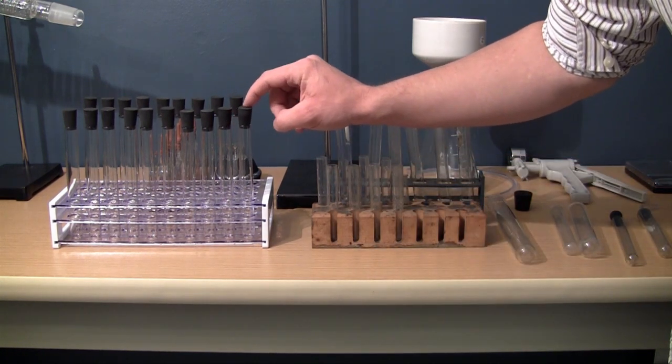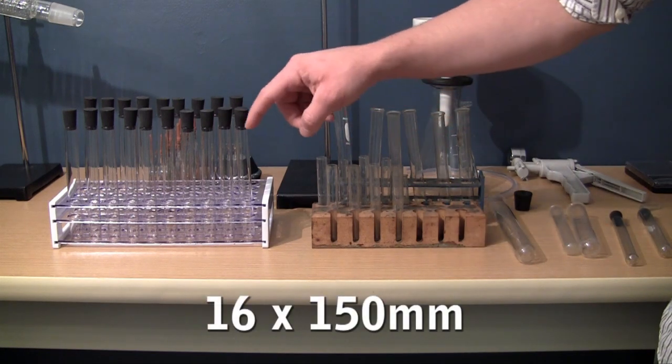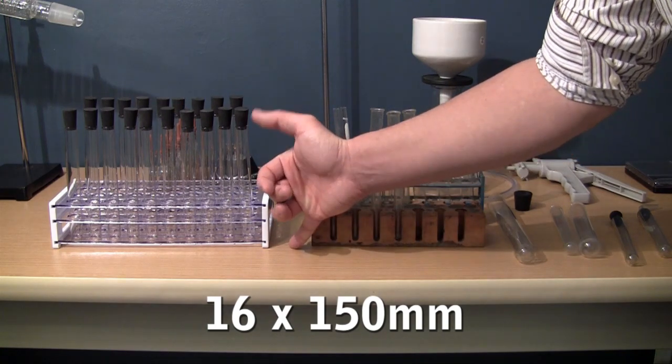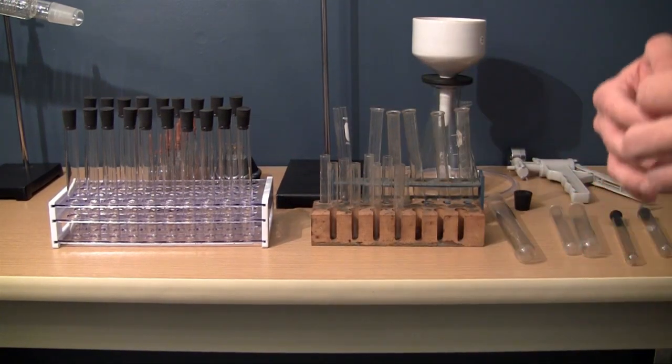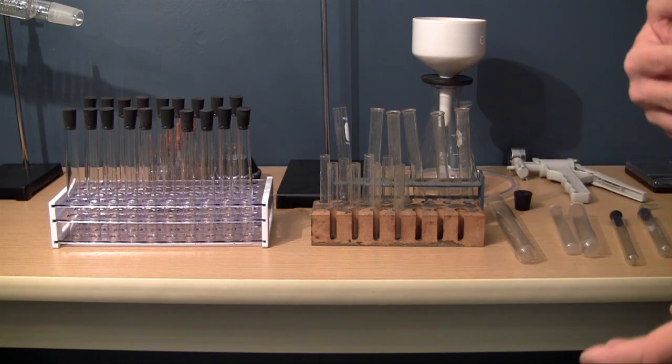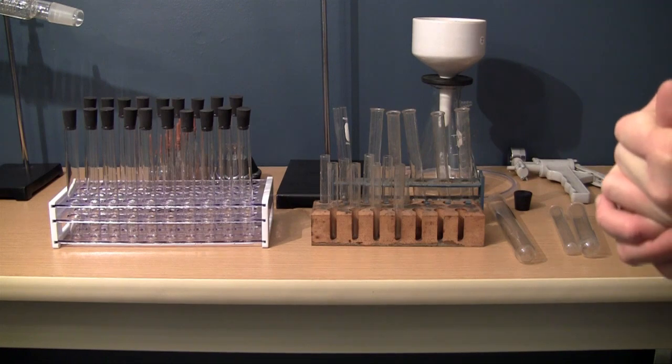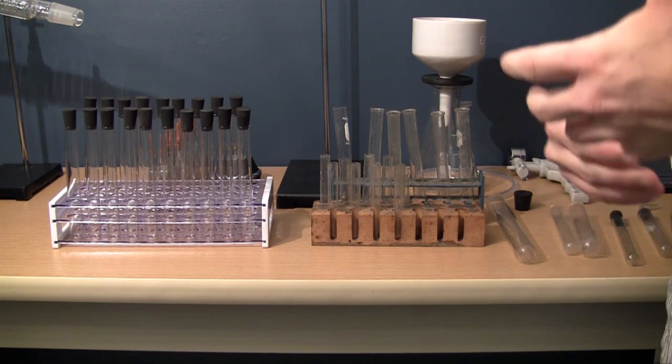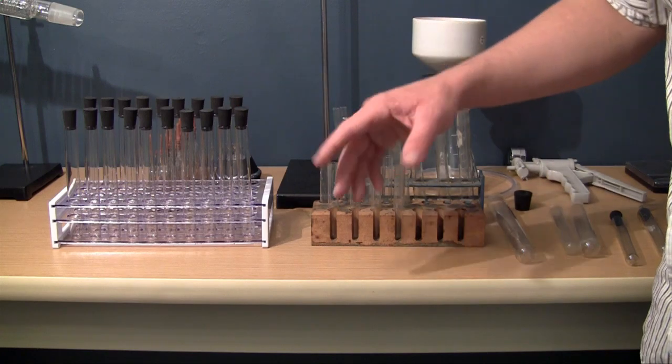Now some of the more common size test tubes, this one right here, these are my favorite - these are actually 16 by 150 millimeter, and what this means is the width of the test tube and also the height. So those are the ones that I use most often. The standard size, if you were to buy only one size in set, you probably want to stick with 18 by 150 because that's the most standard size test tube. I just like 16 by 150, that's my favorite.